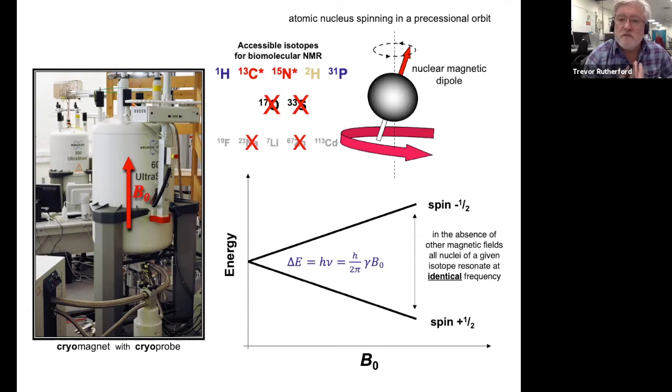So if we want to introduce carbon-13 and N15, we need to specifically isotopically label the protein by expressing the protein in a medium that contains C13 glucose and N15 ammonium chloride as the sole carbon and nitrogen sources for the bacteria to replicate on. So we need to put those in specifically if we want them there. And that's the kind of stuff that is routinely done within LMB.